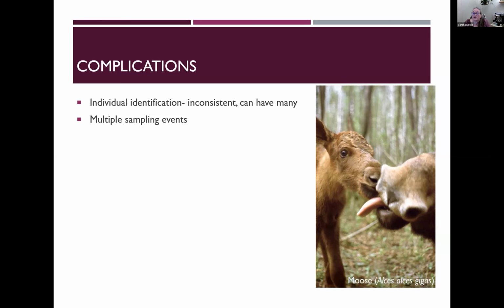It might be being used in another research project as well, so that project might have a number that's associated with that animal or that sample. So we end up with this crazy combination of IDs that we have to be able to track and manage and know which animal it came from, so that we don't have animals going into our database multiple times, even though it's all the same animal.